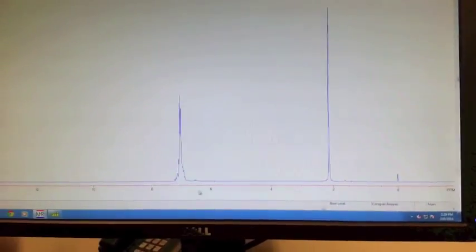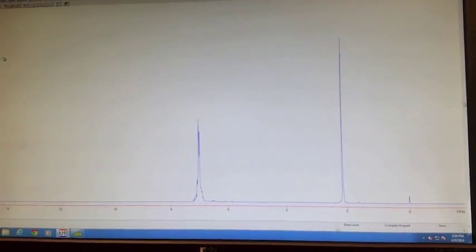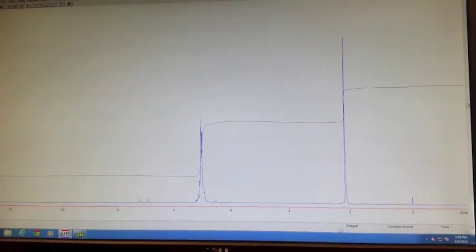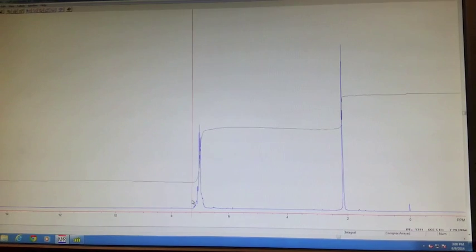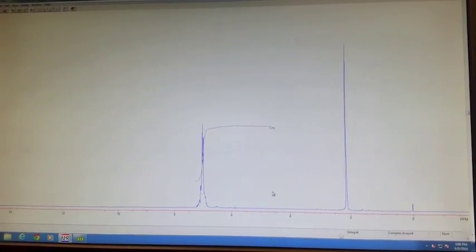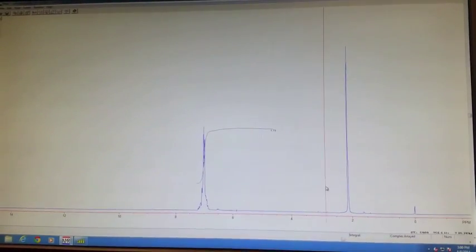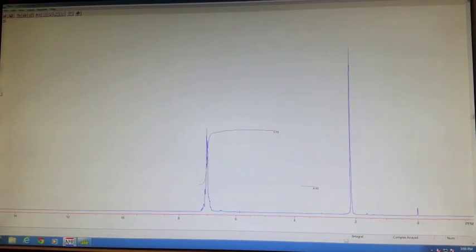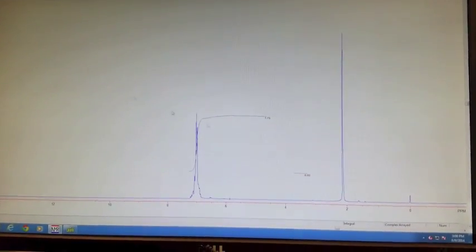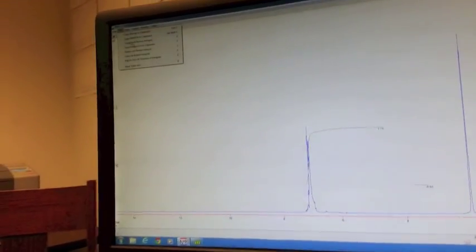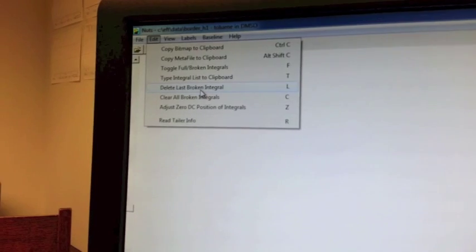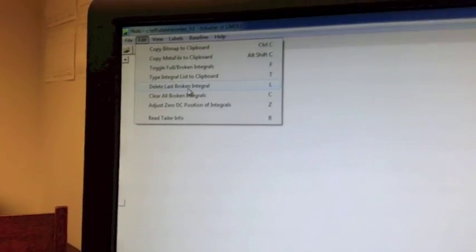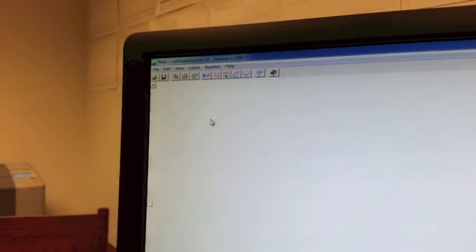The next problem that people often run into happens when integrating. Sometimes people integrate the wrong area, like too wide for example, or you just integrate a random place. To fix that, you can go to Edit and you can either delete your last broken integral, which will get rid of the last integral you just defined. Or you can go to Edit, clear all broken integrals, and just start all over again.